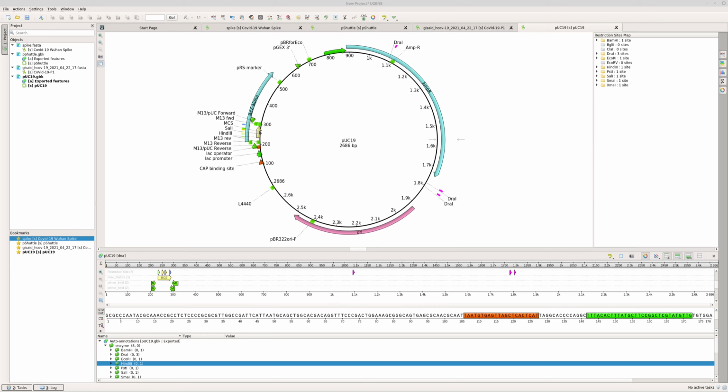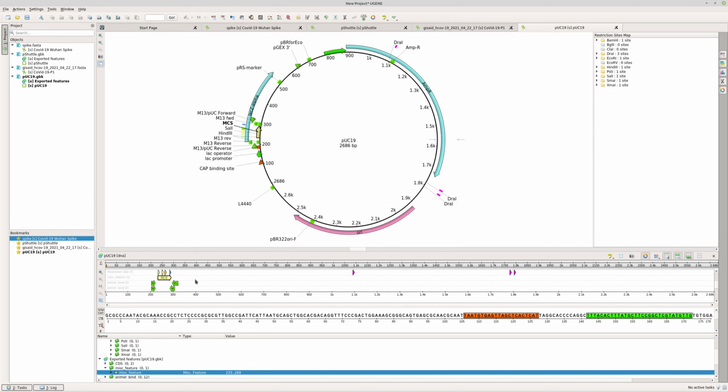However, the multiple cloning site, or MCS, we can see here we have some colored in this region here called MCS. Another point of view is here when we look at the linear annotation, there's the MCS, and we can actually scroll upwards, and we can see that they are also within this gene called LacZ alpha. And so the restriction sites are listed here and as they're annotated.